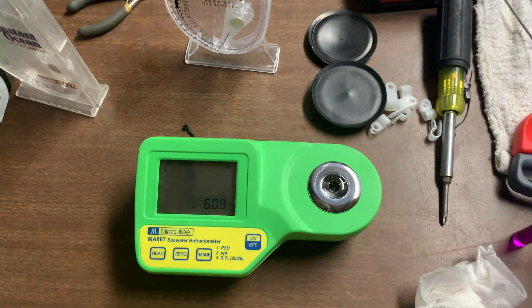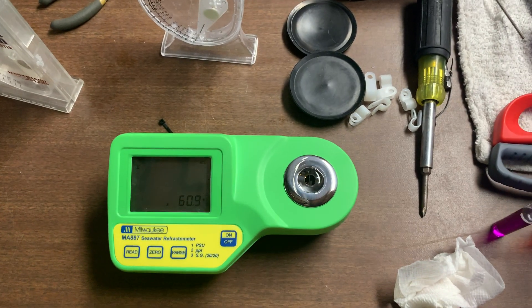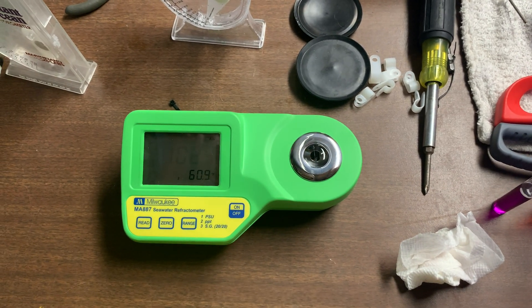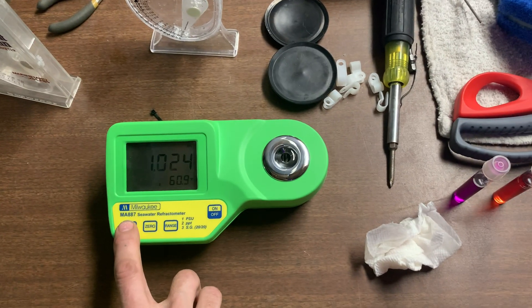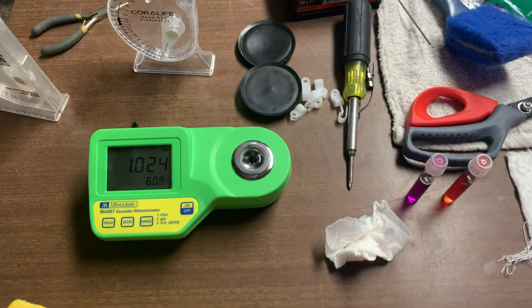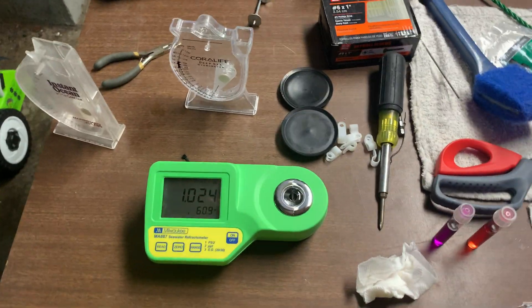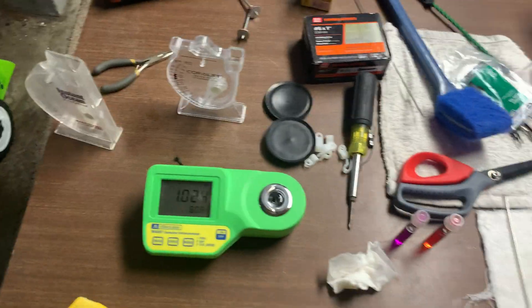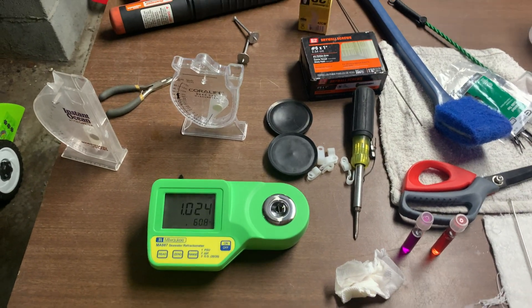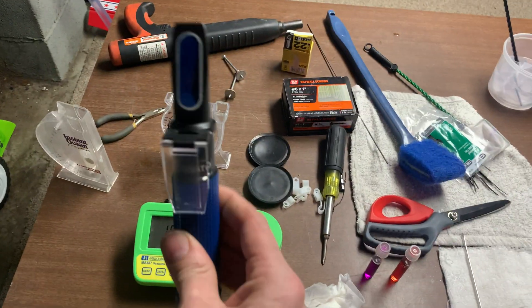Now you can hit read, and sometimes it will read different. Now it's even higher. Hit read again. Now it's higher. The same one. Read again. Now it's reading a little higher than it was. These things are so finicky. I basically have now come to a conclusion that whatever I get on this, I read it about three times, and whatever I get the most consistent reading from is my answer, and then I compare it to this one.